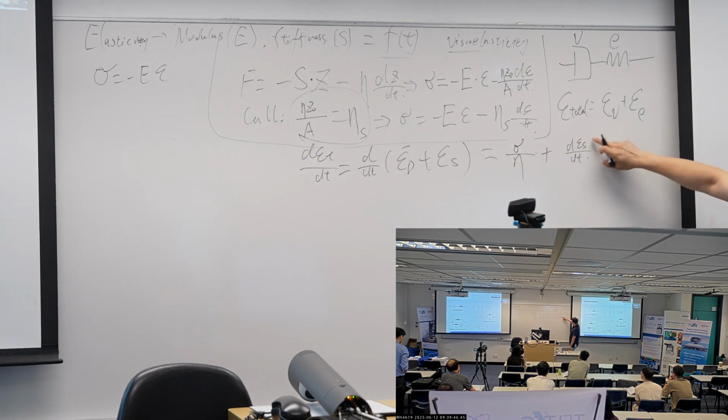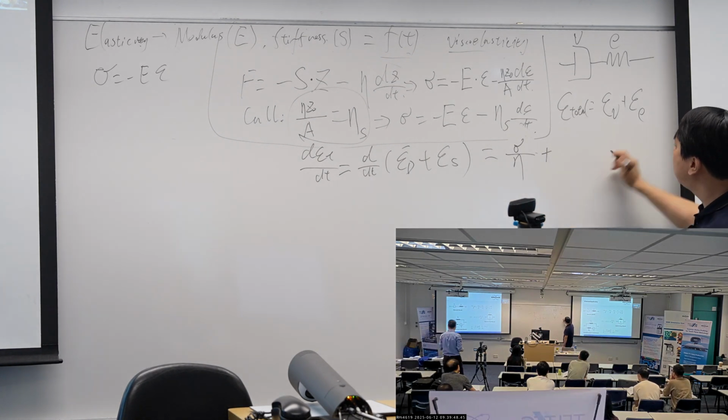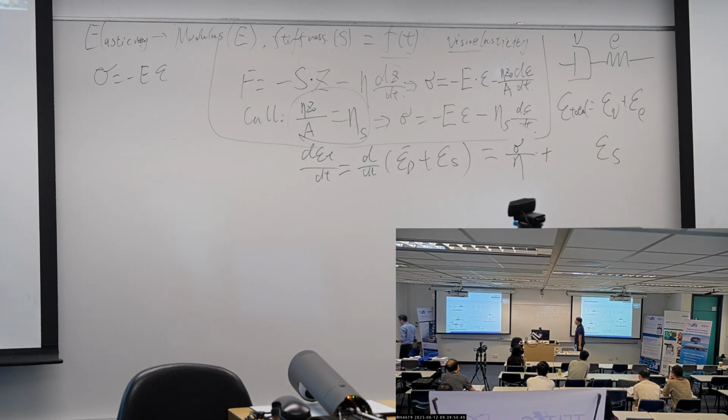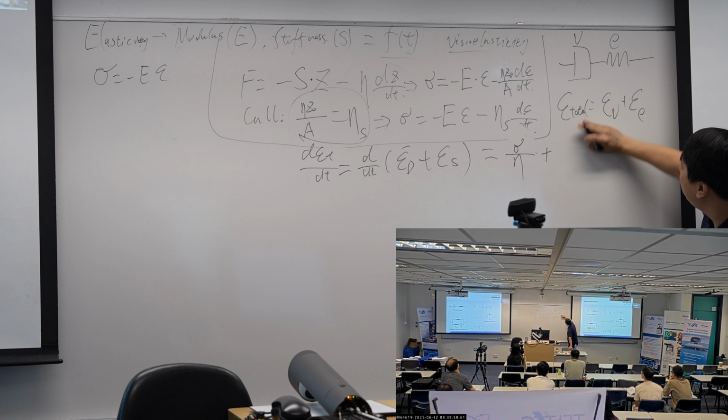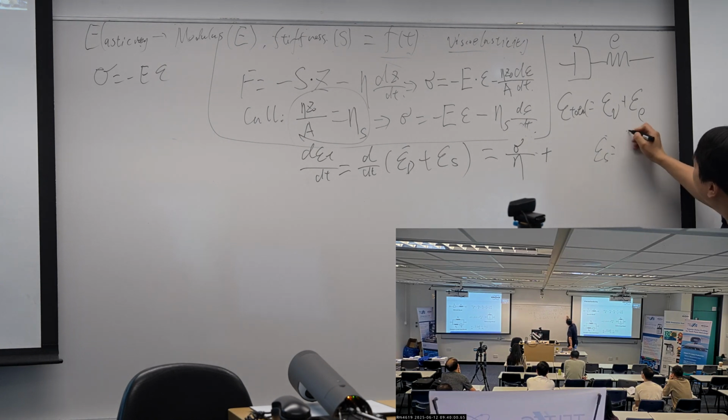And for the spring part, since we consider it a pure spring, we can bring in Hooke's law.